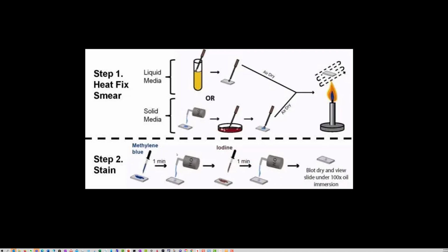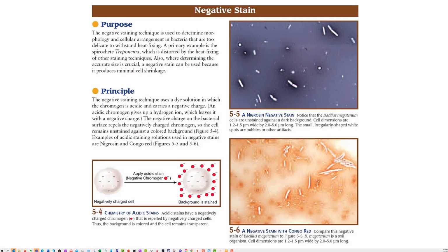Now obviously we don't use methylene blue dye for the gram stain. We use the crystal violet, and that is not represented here, but that's okay. The same kind of steps are used. If we want to look at whether it produces a polysaccharide or not, we use a negative stain. That doesn't actually stain the microorganisms. It's negative from the standpoint that it doesn't stain the bacteria, but the polysaccharide surrounding it. That's the idea.